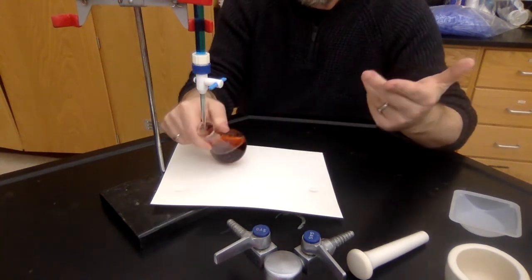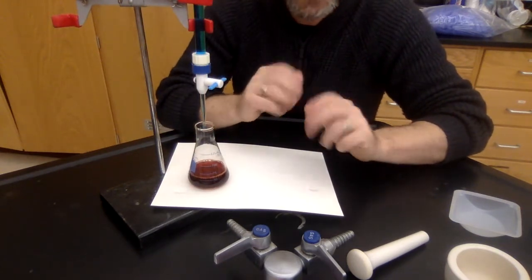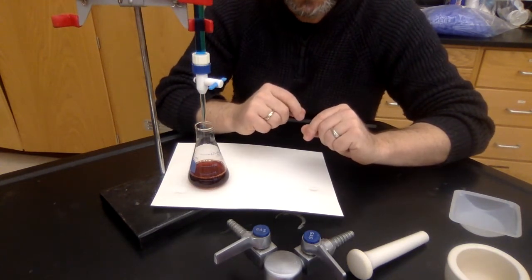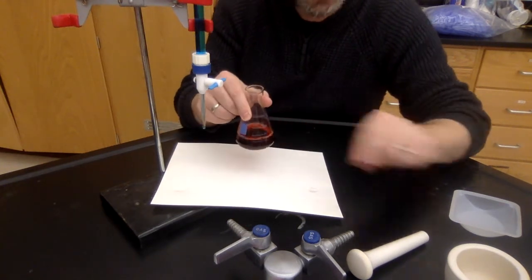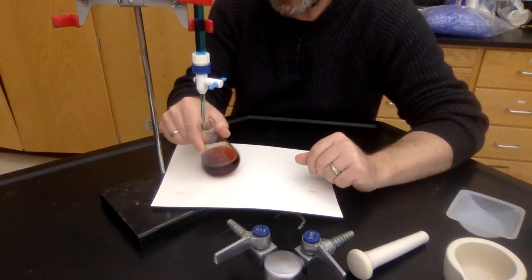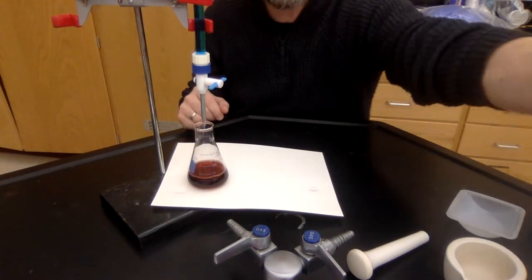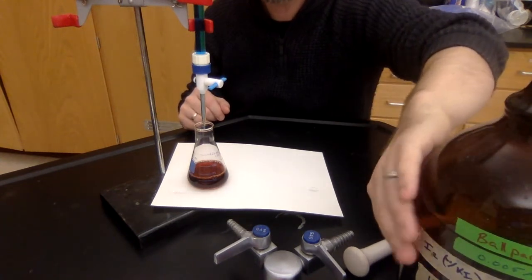And then let's say in this hypothetical at the end of day one, I have used 17 milliliters of my titrant. What I do is I assume that this was correct because it came from something I made. So I assume it's correct. And I recalculate what is the concentration of this stuff here, okay?